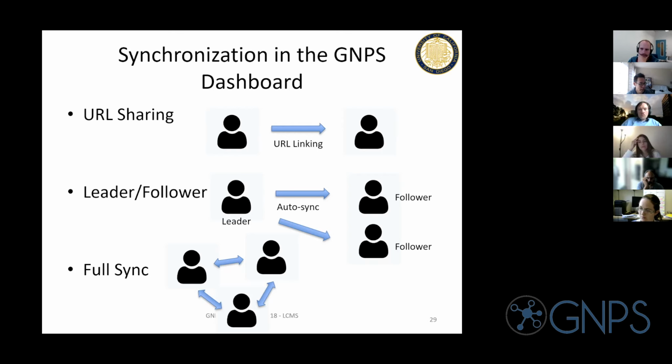And so this will allow you to, if you make a change, you change the XIC, you add an XIC, you add a file, everybody within that session will see those changes nearly immediately. And so you don't have to say, oh, let me edit. It's just like everybody edits and then everybody gets the edits.